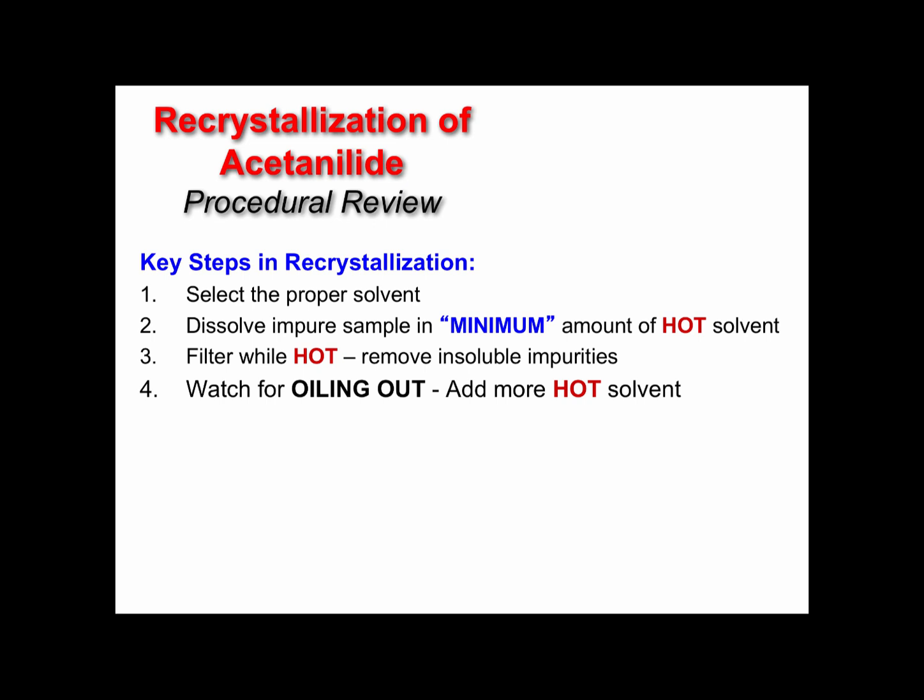Just back to recrystallization. Remember the recrystallization of the acetanilide. You have to go through the same procedure once again. We're telling you it's water, so you're not going to have to figure out what the solvent is. We're telling you right up front it's water.